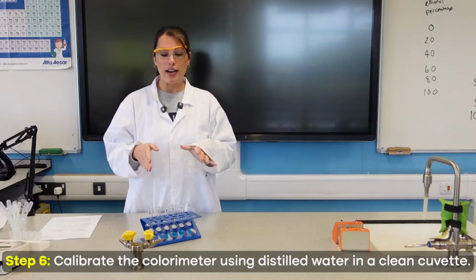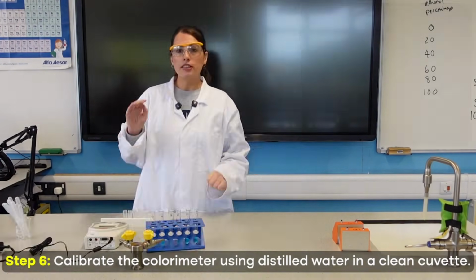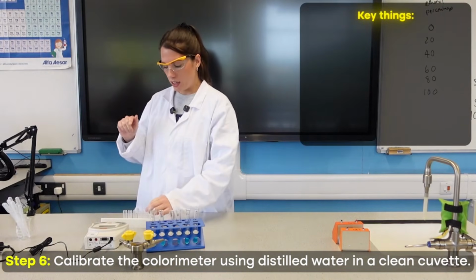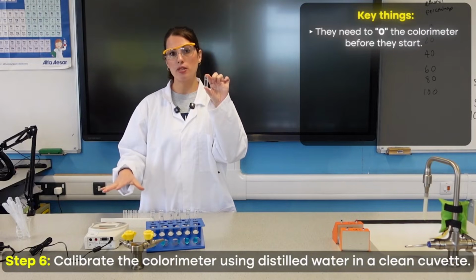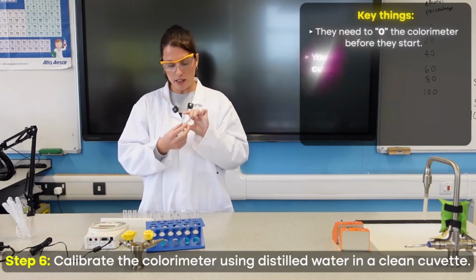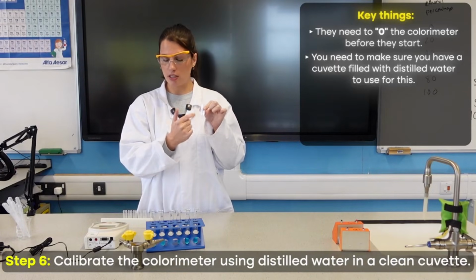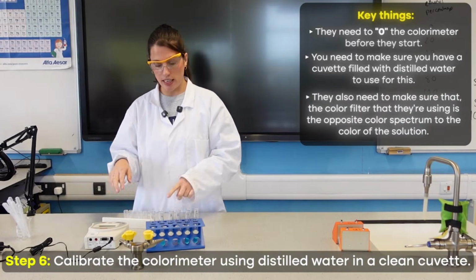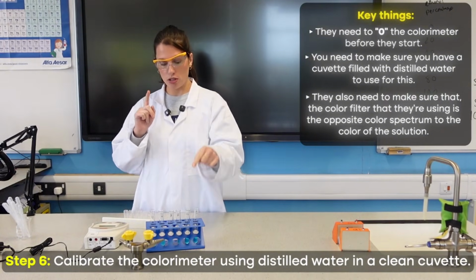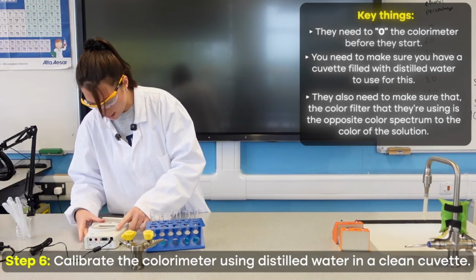So we're now ready to transfer our solutions into the cuvettes for the colorimeter. So with the colorimeter, some of the key things that you need to make your students aware of are, first of all, they need to zero the colorimeter before they start. So you need to make sure that you have a cuvette filled with distilled water to use for this. They also need to make sure that the color filter that they're using is the opposite color spectrum to the color of the solution. So this is blue, so I'm going to go for red.